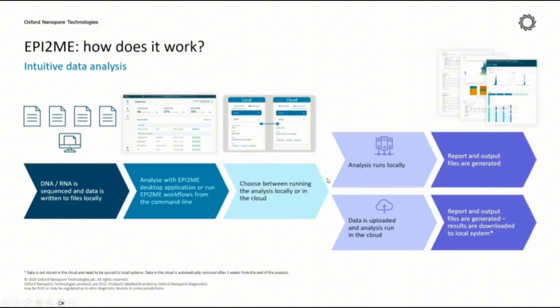So this software can actually handle the analysis run locally on our computer. It depends on where we install the software. Normally the analysis can be run using that particular computer. But in case some computers do not have sufficient computational power, like the CPU and memory, we can also run the analysis using the cloud provided by ONT, free. Everything is also handled by the Epi2Me software, so we do not need to worry about how to set up the cloud instance or how to upload the data. Everything is taken care of by the Epi2Me software when we have it installed on our computer.